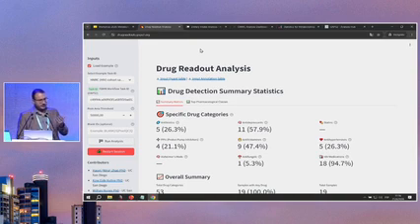If you are not sure about some information, you can always check the number of peaks and, as I said, the cosine score, which in this case is the standard calculation for the comparison, and is also present in the GNPS job. That's why they work as a streamlined tool.